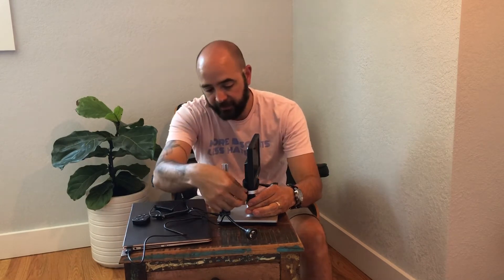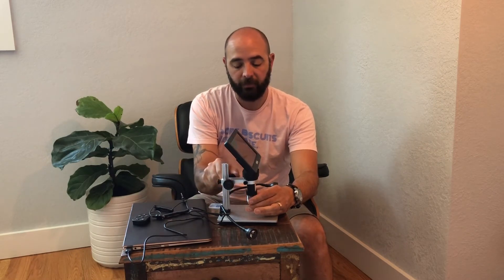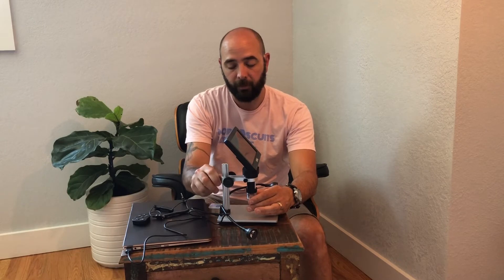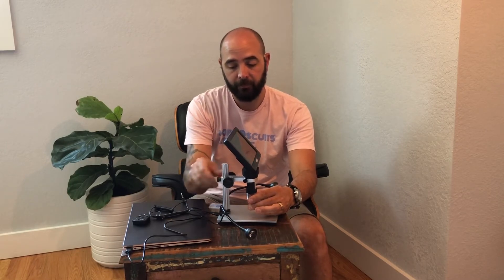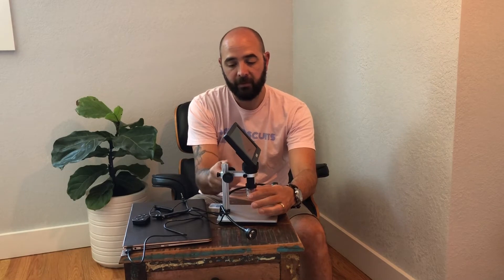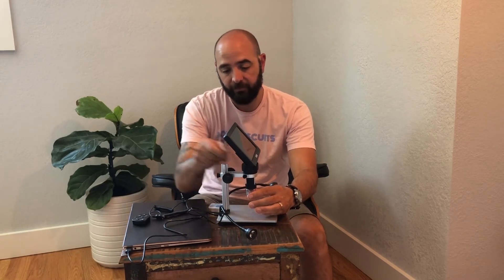Go ahead and tighten these and lock them in. Now this is ready to move. The knobs on the sides help you get it just right to where you want it, and then the one in the back goes ahead and locks everything in. Now we're ready to go.